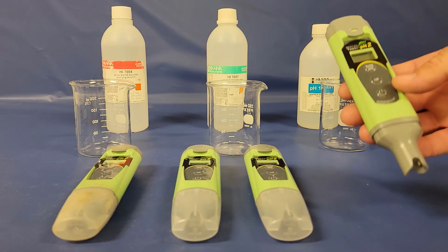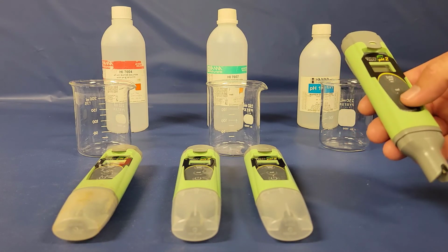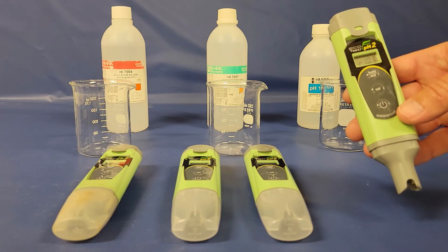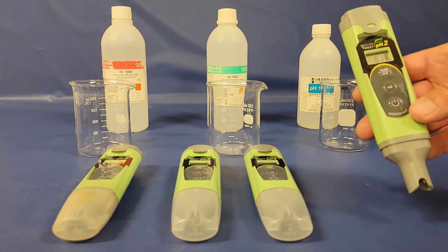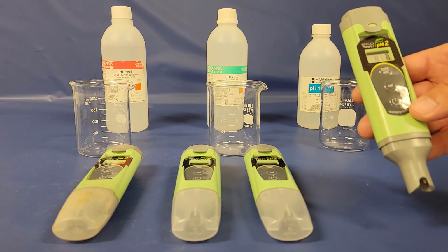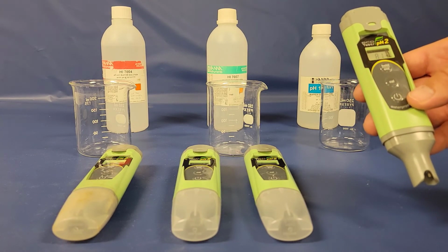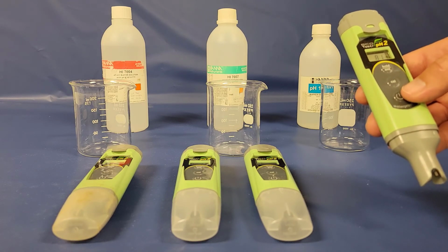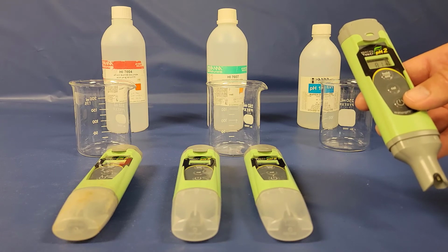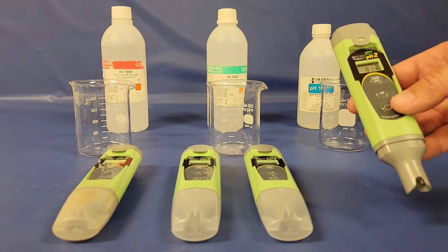This particular unit does only pH, but you're going to turn it on here so you can see. Right now it's just reading the air and it says a pH of 8.1, right? But what does that mean? It really means nothing yet. So we need to get this into some solution to verify that it is calibrated. And then if it's not calibrated, we'll go through the calibration procedure with you as well.